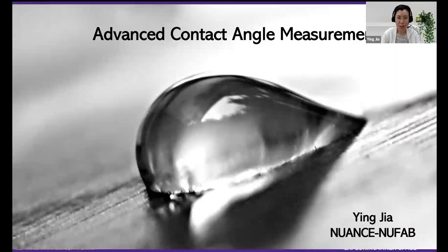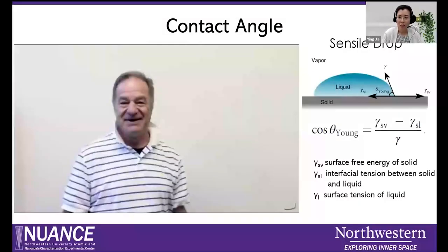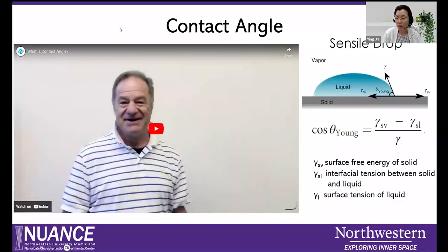Then today I'm not only going to talk about advanced contact angle, we will also cover some basic ones which we have already had in NUFAB for many years. Okay, so the first slide is just the background knowledge about contact angle and how a contact angle forms. So we're going to play a quick short video.